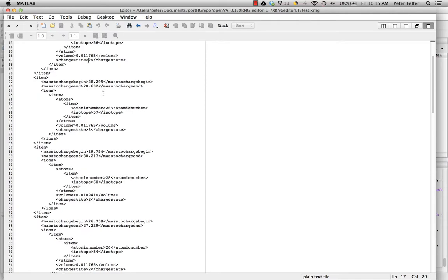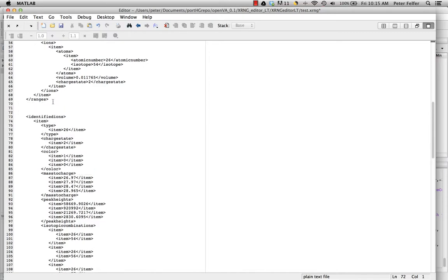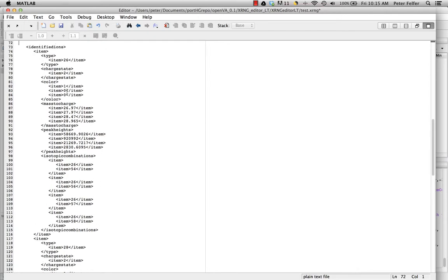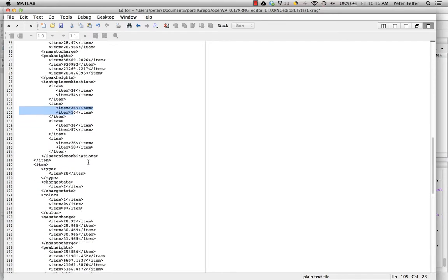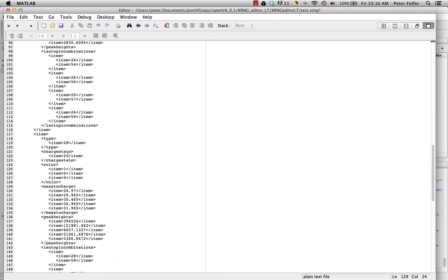It seems that a couple of people out there are doing experiments where they do isotopic diffusions and things like that. So the range file is pretty much down to here. We haven't actually defined many ranges on here, just because it's a short tutorial. And then you have the identified ions, which is just the peaks that you saw, the red peaks. And you can go and have a look at how high the peaks were, where the peaks were, and what the isotopic combinations of the ions that you have defined now. For example, it's very easy to see that that's an iron peak, so 2654 is iron 54, 2656 iron 56, and so on and so forth. We didn't have any complex ions in here really. Then this list would of course be a little bit longer.